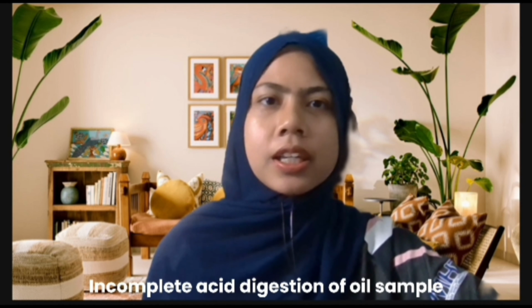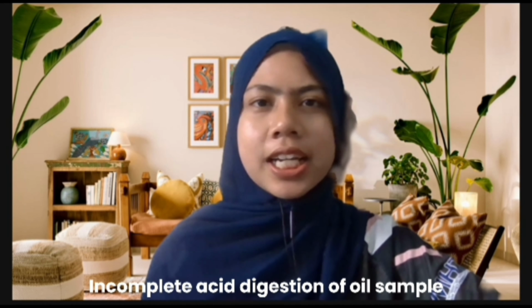For question 6, state two possible sources of error in this experiment. First, incomplete acid digestion of the oil sample. If the nitric acid digestion is insufficient, Na+ and K+ may not be fully released into the aqueous phase, leading to underestimation of their concentrations.